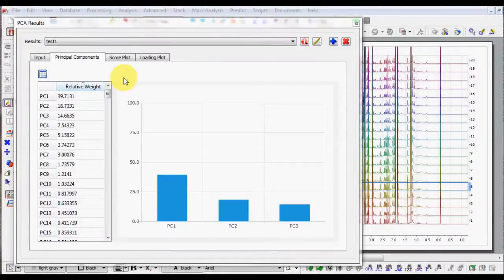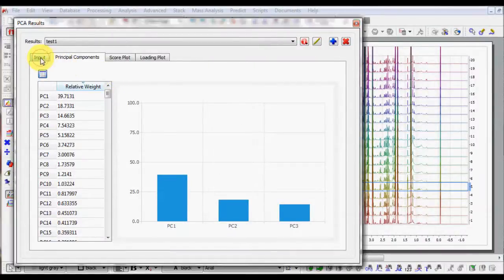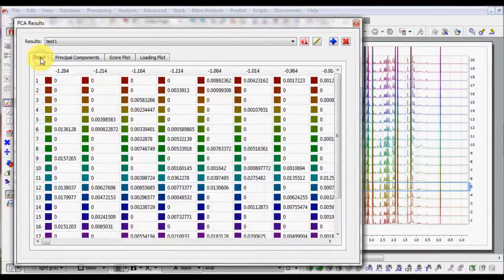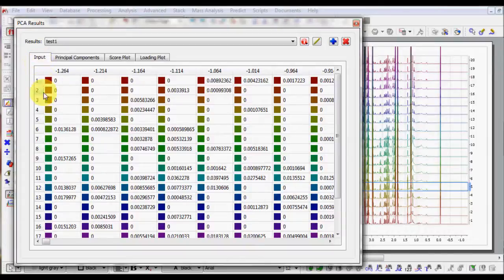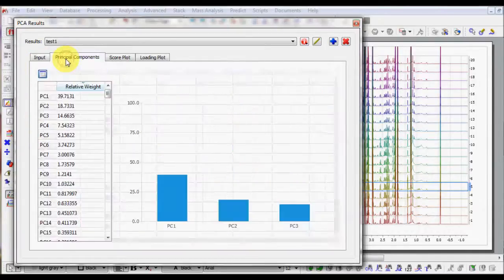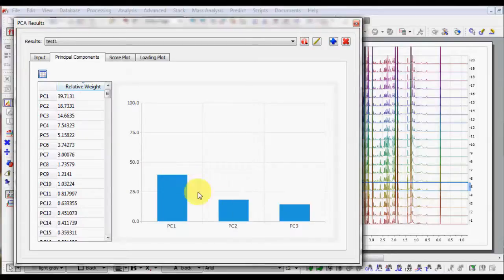The results are organized in four tabs: Input, Principal Component, Score Plot and Loading Plot. Principal Component tab displays the percentage calculated for each component.